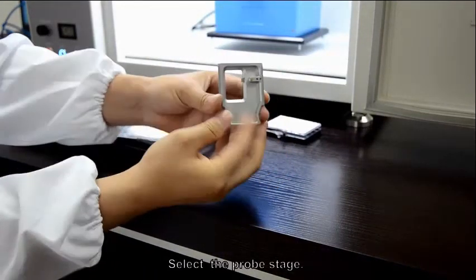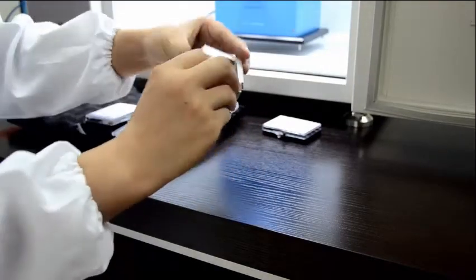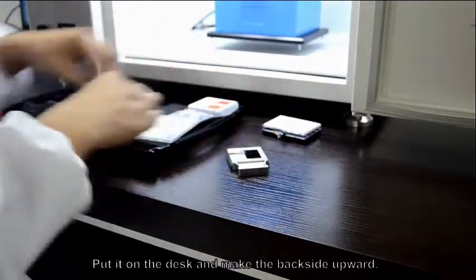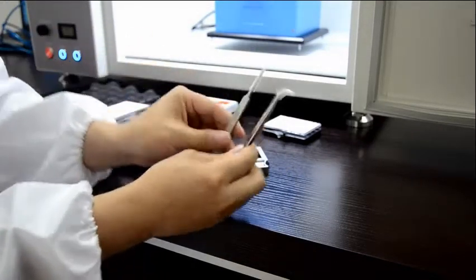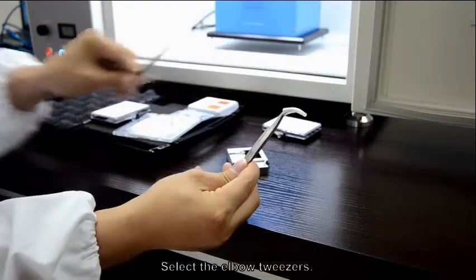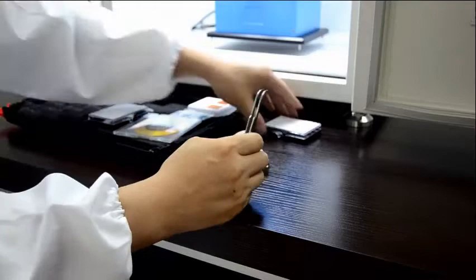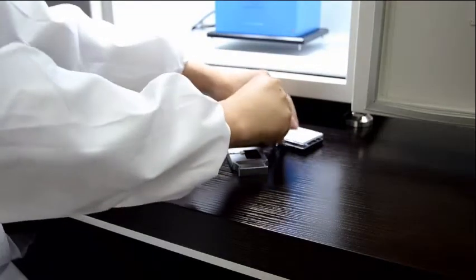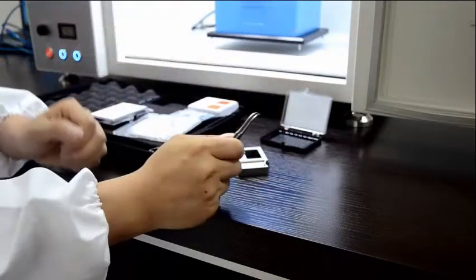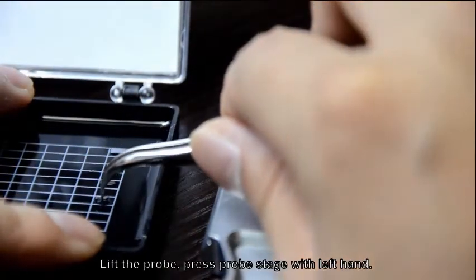Select the probe stage. Put it on the desk and make the back side upward. Select the elbow tweezers. Lift the probe and press the probe stage with your left hand.